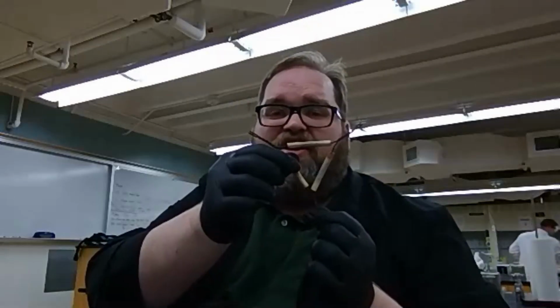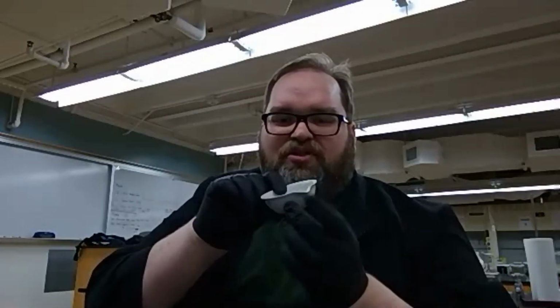The iron ring is too large, so I'm also going to need something called a clay triangle. It's called a clay triangle because these little bits right here are clay, and they're in a triangle, okay? We're also going to need a funnel. We're going to need an evaporating dish to catch the liquid. Notice it's just a bowl that has a spout on it, but it's very shallow, and it's made of ceramic, which means that I can heat this really hot to maybe dry off something that takes really high temperatures to dry.